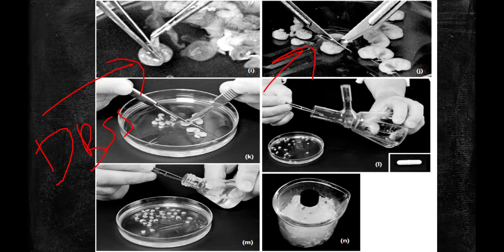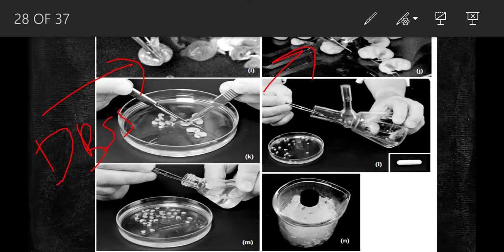Then it's kept on one side of the petri dish to bleed so the blood comes out, and then you transfer that into a fresh petri dish.